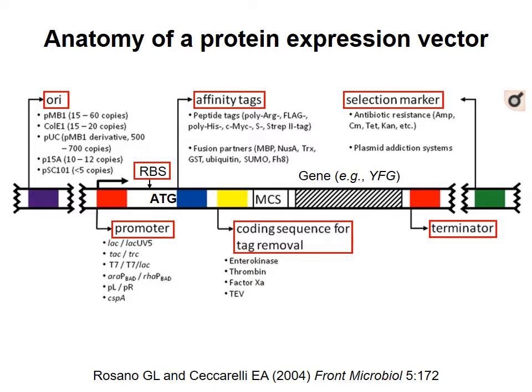You want to include a protein affinity tag in the gene. The tag is usually put at either the five-prime end or the three-prime end of the gene so that the tag will be found at the N-terminus or the C-terminus of the polypeptide. Some tags are short sequences, such as the FLAG tag, which is a specific eight amino acid sequence recognized by an antibody. Another tag that is often used is a polyhistidine tag, in which six or eight histidine residues appear in a row. These consecutive histidines will bind to nickel ions immobilized on a chromatography column. Often you include a sequence that is the target for a specific protease such that the affinity tag can be removed from the protein product.